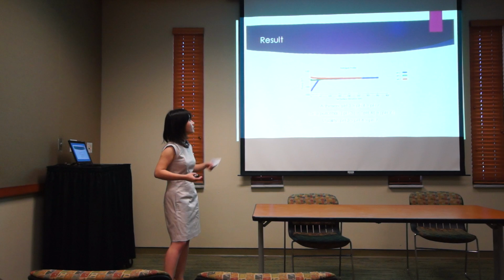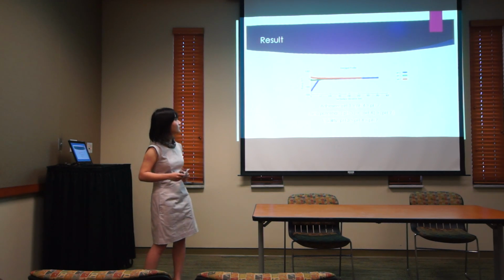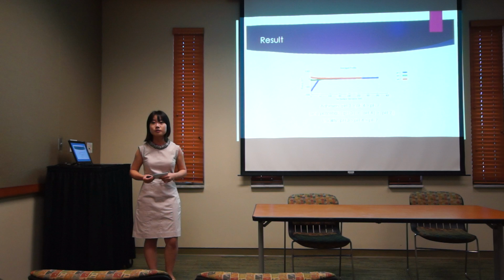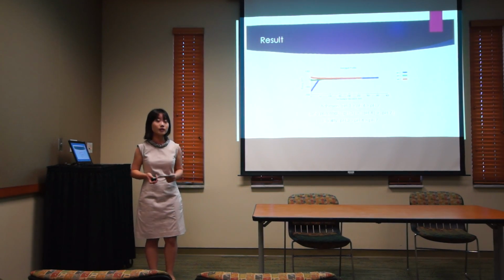And also the zeta potential at pH 3 is the greatest among the 3 pHs, and that is validated by past experiments. So using our method, we prove that our research data is generally true.